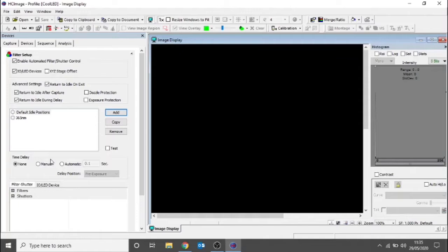In the pE-4000, there are 16 available wavelengths from 365 nanometers to 770 nanometers. These 16 wavelengths come in 4 channels, meaning up to 4 LEDs can be switched on at once. The choice of wavelength and intensity required could be chosen and selected below, under the I/O LED device tab.